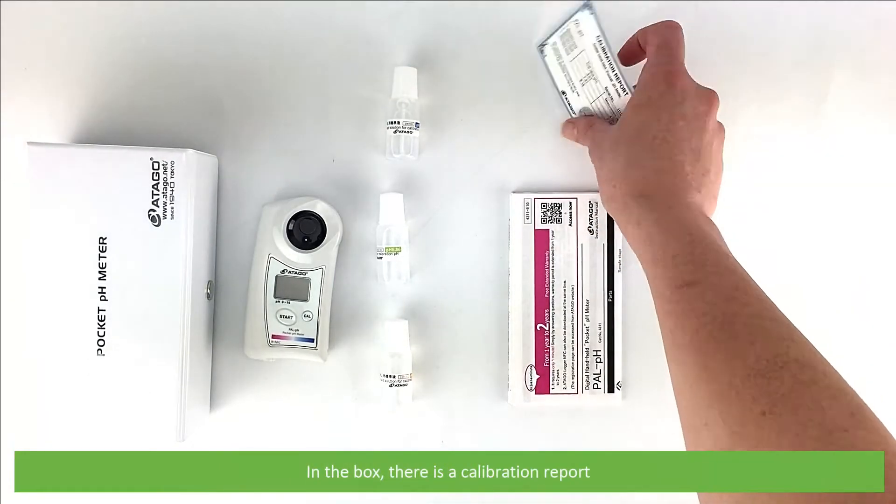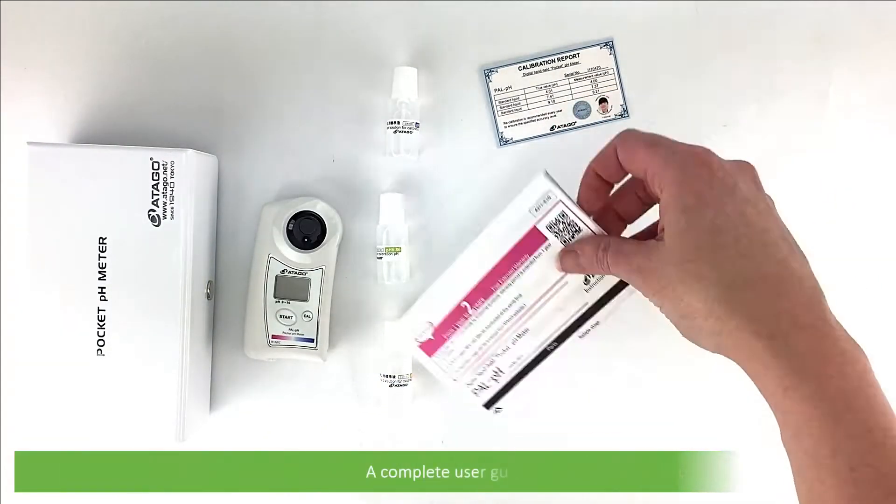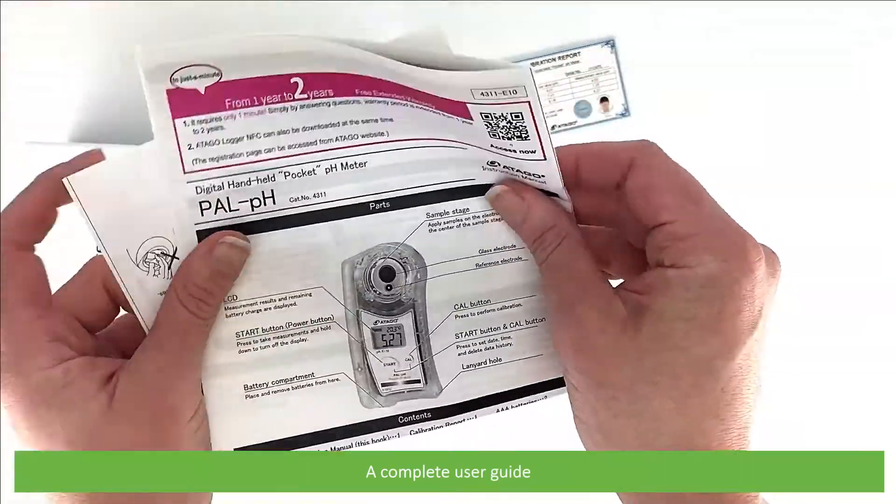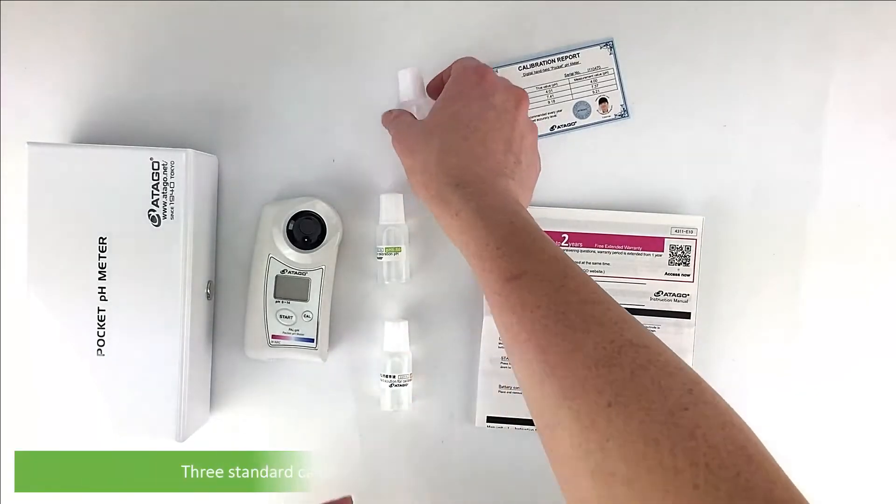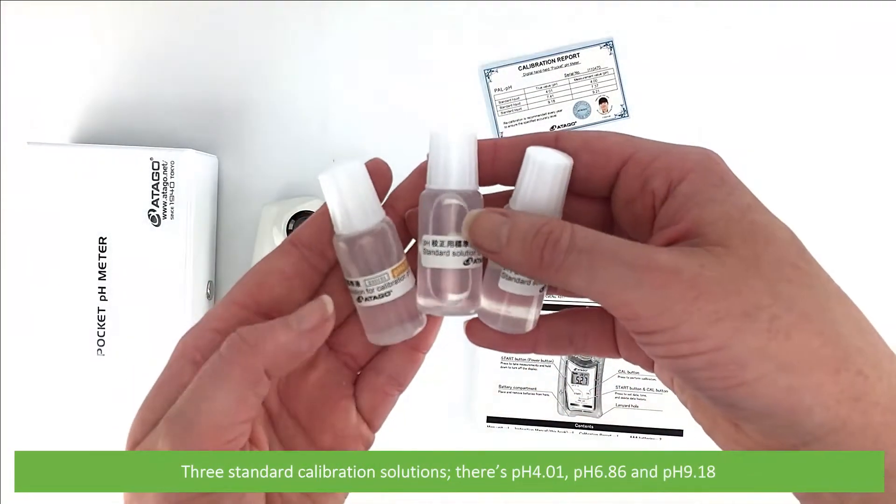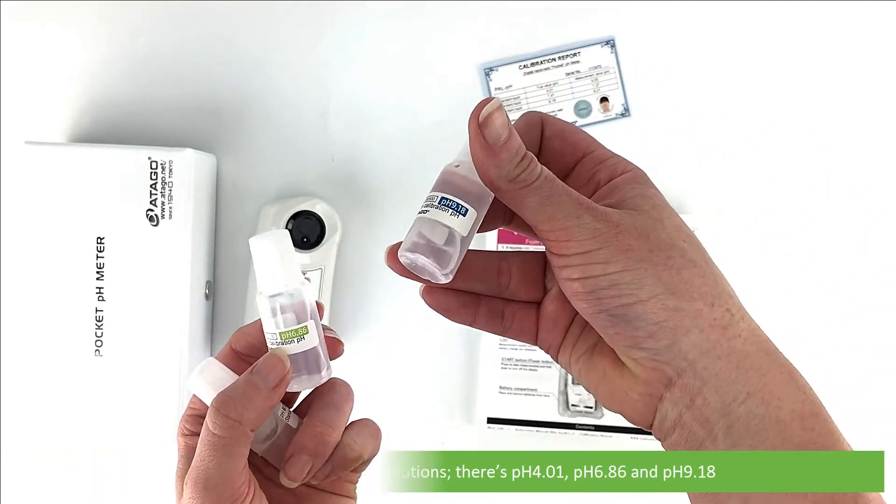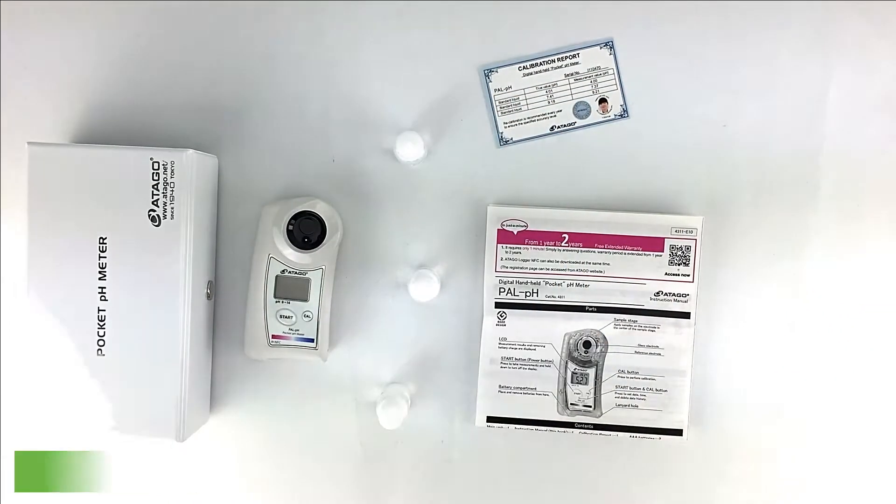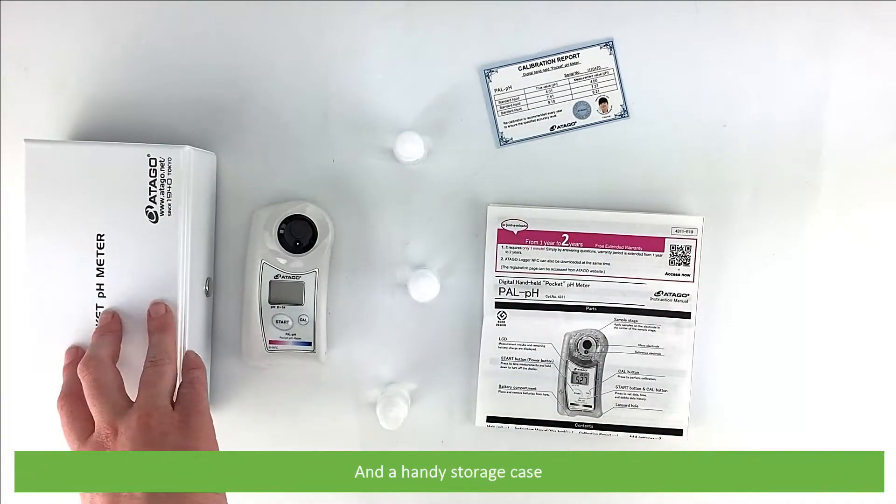In the box there is a calibration report, a complete user guide, three standard calibration solutions: pH 4.01, pH 6.86 and pH 9.18, the pH meter, and a handy storage case.